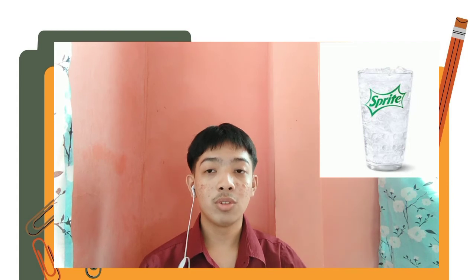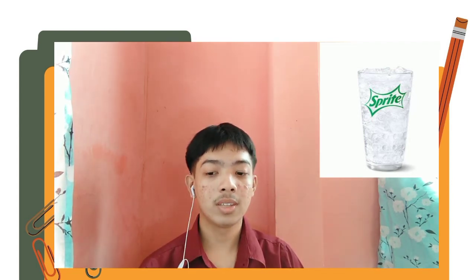After that, we need to calculate the average molarity of carbonic acid naman in the soft drink sample and then express the answer in 3 significant figures and then use the average molarity of sodium hydroxide obtained in the standardization step. So doon sa video na naipakita kanina, di ba sabi natin kanina during pag-explain natin ng mga apparatus and materials na kailangan natin, we need a colorless soft drink sample and then gumamit doon ng colorless soft drink sample which is Sprite.